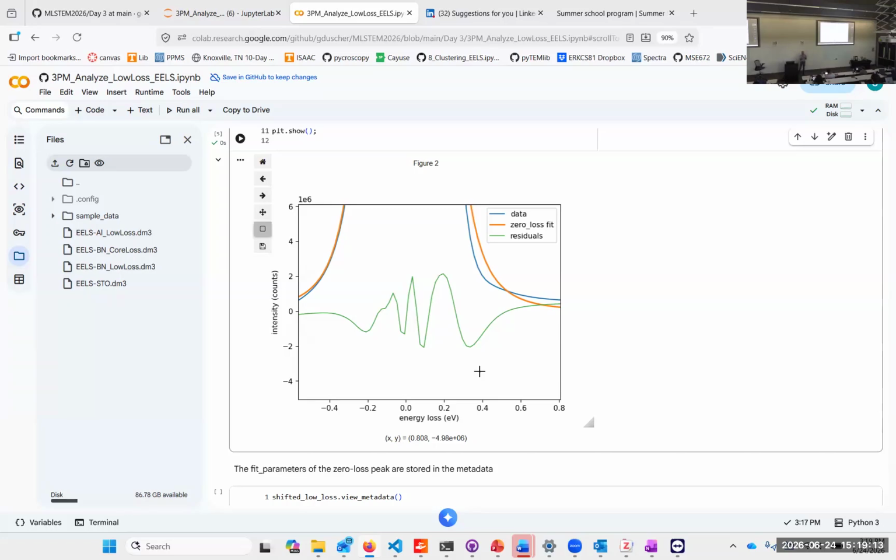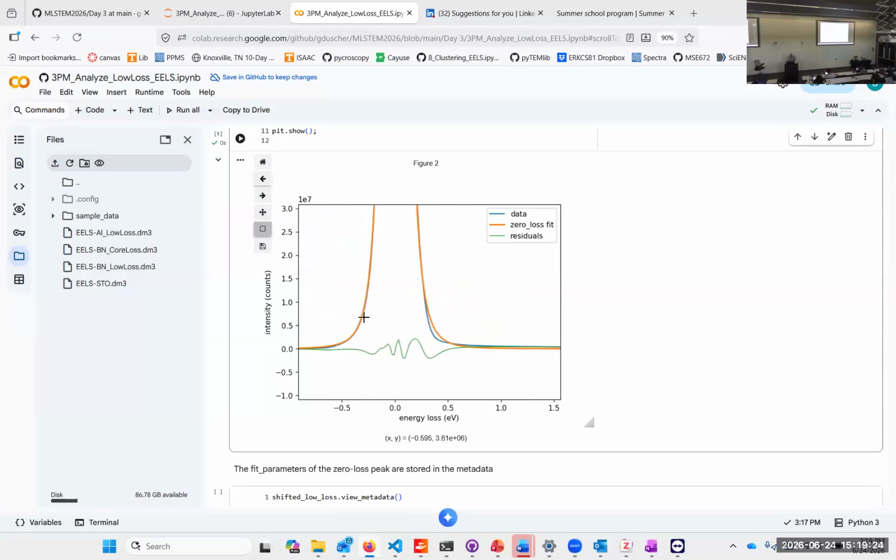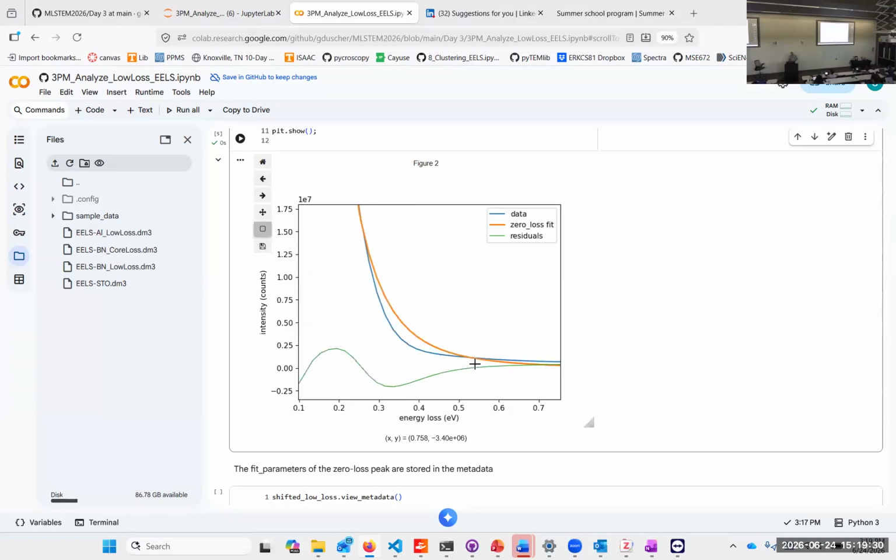And I found that if I fit that, I can even tell which microscope it is from. So I'm not quite sure how that works. So there is not really a physical model behind it other than it works. Here is a deviation on the back side. And the question is, is that already a signal or not?